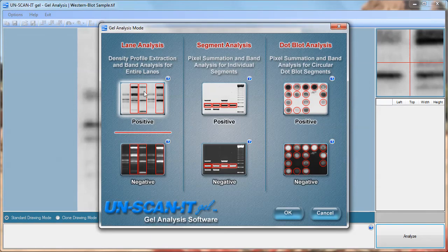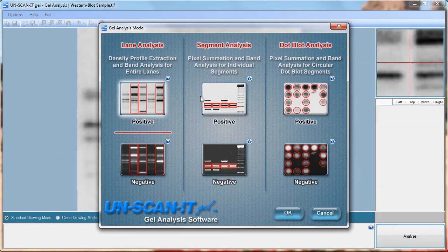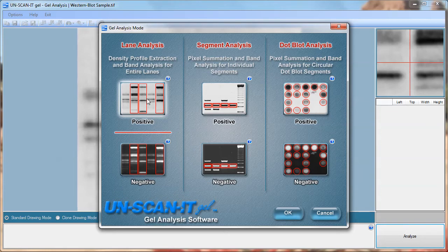There are several gel analysis modes available including lane analysis, segment analysis, and dot blot analysis. For this tutorial we will choose the lane analysis mode. These modes are explained further by clicking the question mark button associated with each mode.